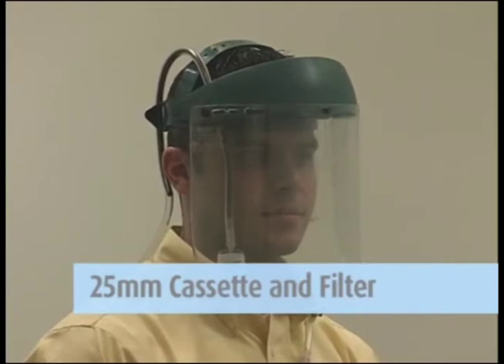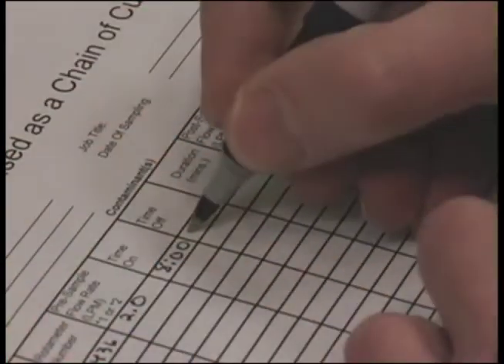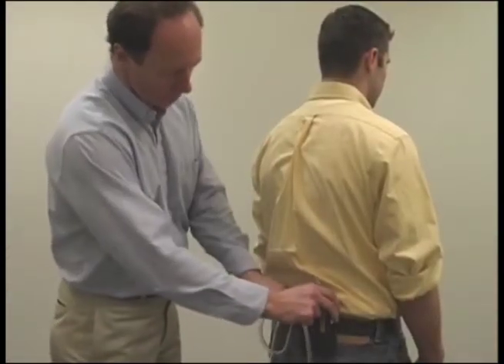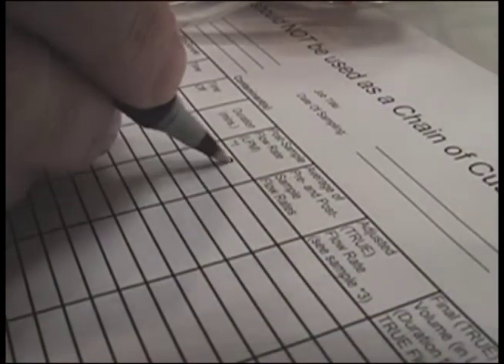This must be requested at the time you order your supplies. After sampling is complete, turn off the pump, record the time, remove the equipment, and perform a post-calibration, preferably in an area with the same approximate temperature as was used during the pre-calibration.